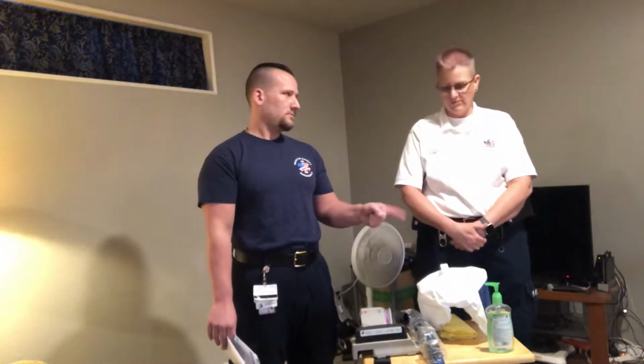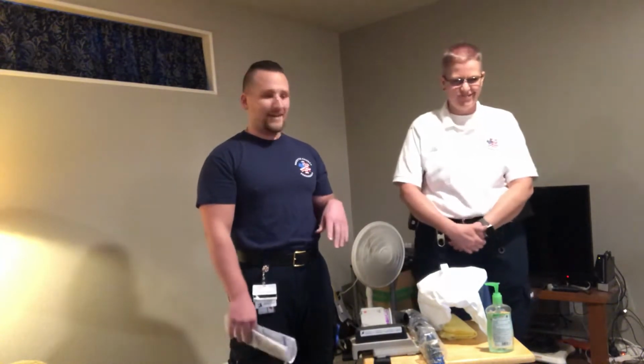Right now we have a small hood. She's working on getting medium and larges now, and I've even heard, I don't know if this is true, that they may be making custom XL PAPR hoods now for those of us with truly ginormous melons. I'm serious.